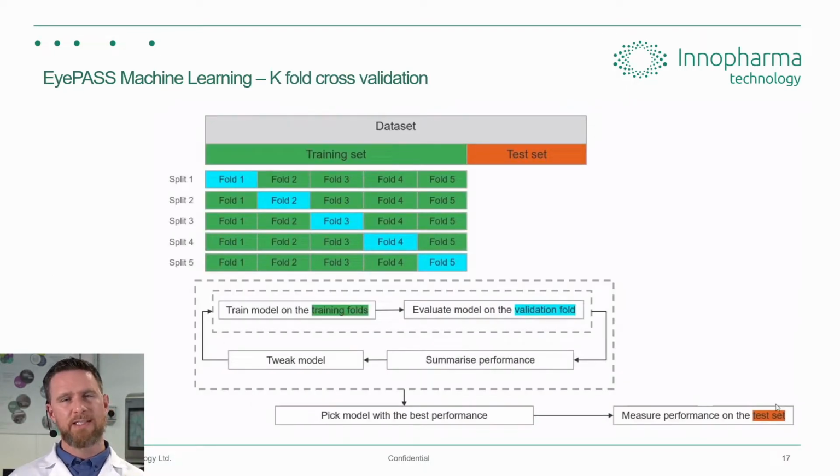So what happens behind the scenes when we're doing this evaluation of our machine learning models? We use a thing called K-fold cross-validation. And this is a statistical method used to estimate the skill of the machine learning models. The data splitting process can be done more effectively with this K-fold validation method. And the splitting process is done without replacement. So each observation that is used for training and validation is only done exactly once.